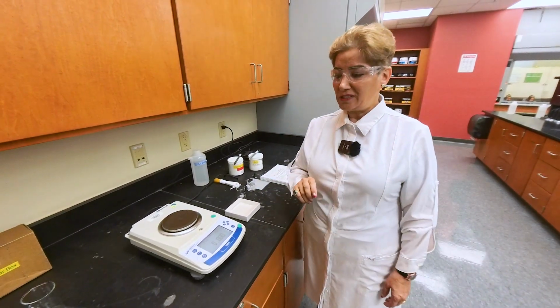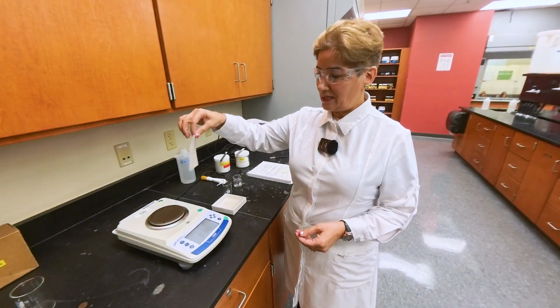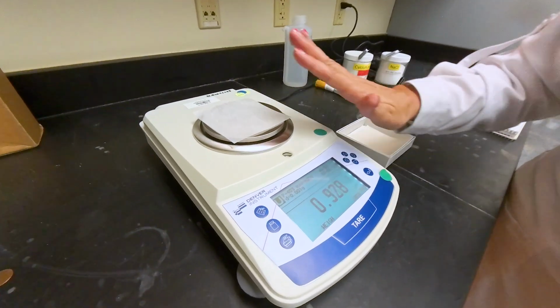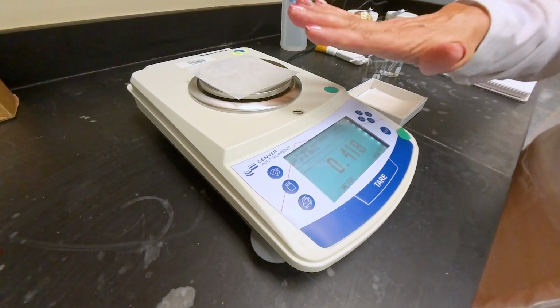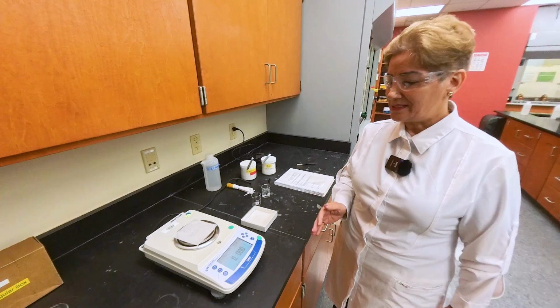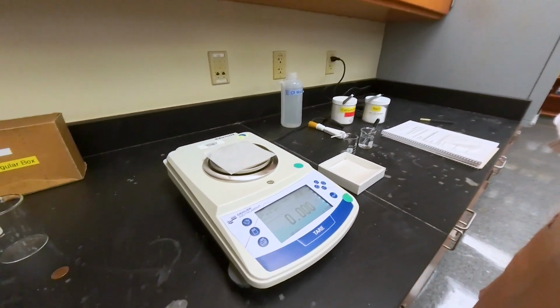For the first part of this experiment, measuring mass directly, I am using the weighing paper. You don't need this for measuring directly, but I am using it to protect the balance pan from the chemical and anything that I place on it. Since I don't need the mass of the weighing paper, I'm going to press the tare function, and it shows 0, and it's very sensitive. If I move my hand over, that number is going to change, so I have to wait until it shows 0, and then I place the first item.